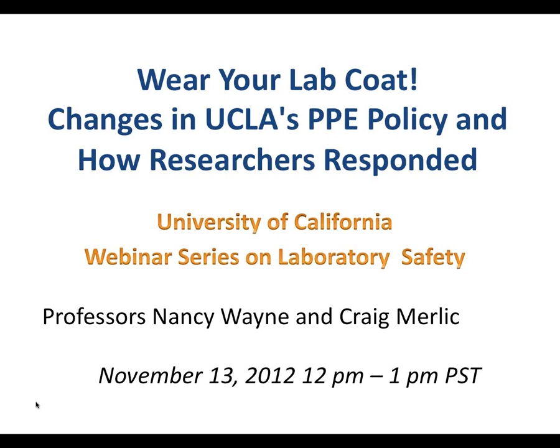Change their culture. Yeah, so things are a little bit different in the medical school where we have far fewer students, and the primary researchers are postdoctoral fellows. 60% of the postdoctoral fellows are from foreign countries where they have a very poor standard of lab safety. And so getting them on board, getting them trained, it's a real challenge.